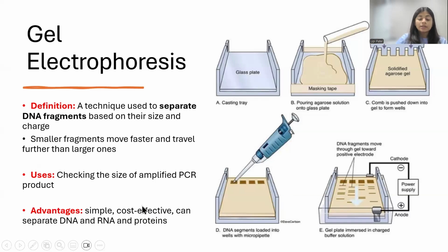Advantages are it is very simple, it is cost effective, and it can separate DNA, RNA, and also proteins.